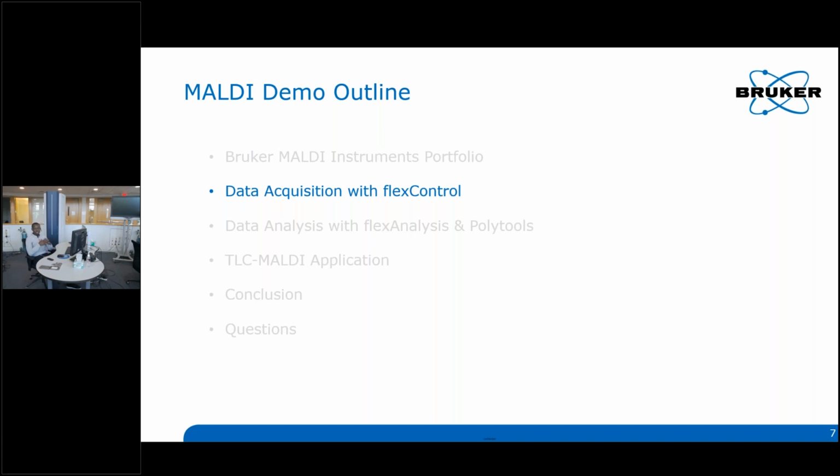As soon as you acquire data, it loads into the processing software and then into our dedicated polymer analysis software. These three are called Flex Control, Flex Analysis, and PolyTools in the end.